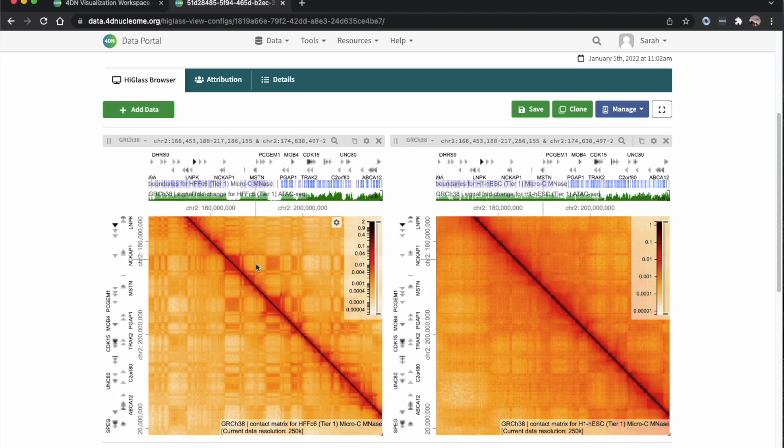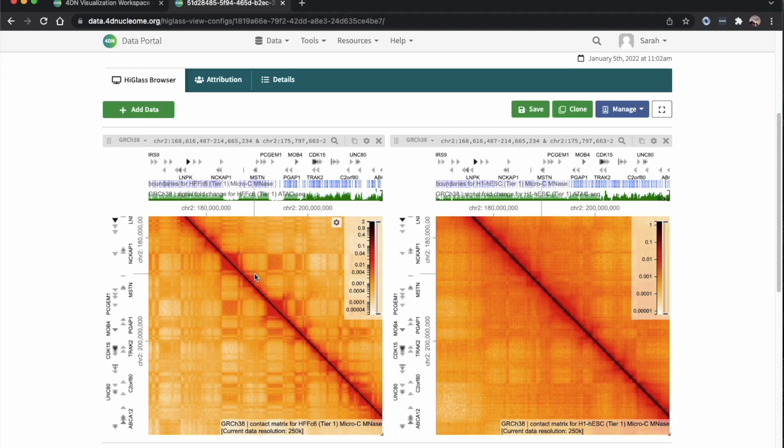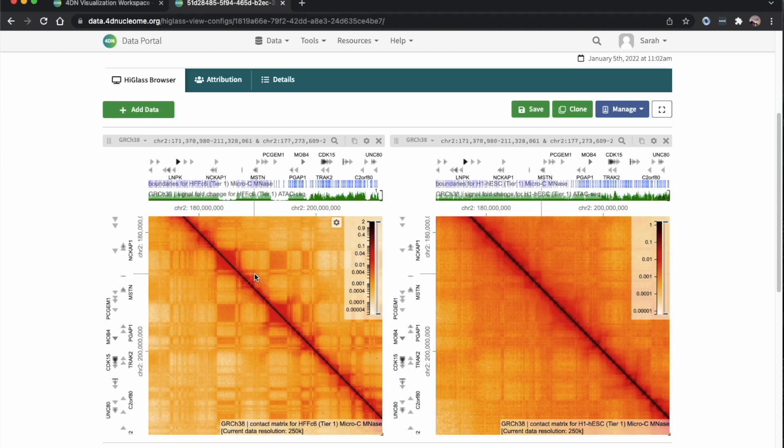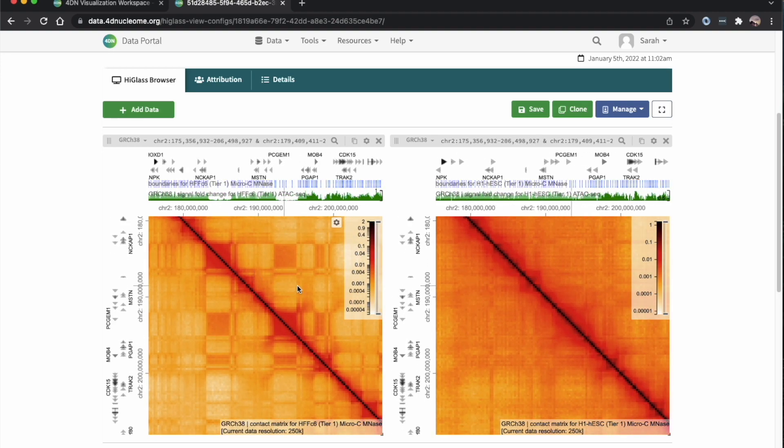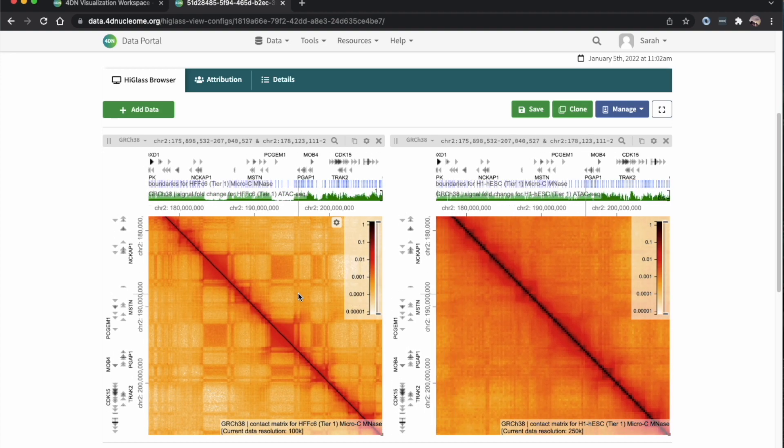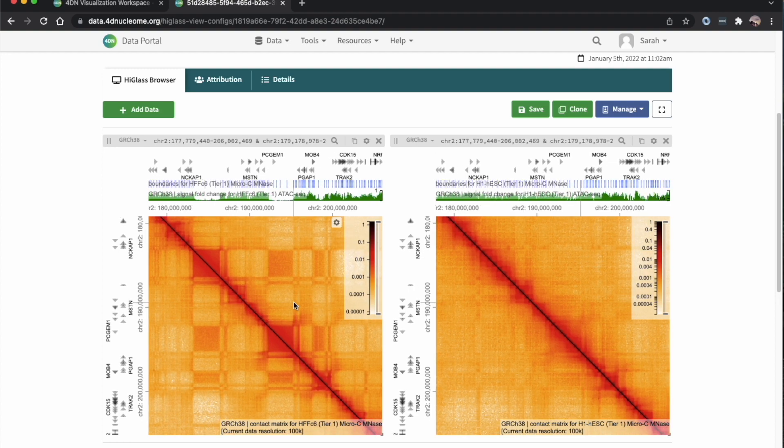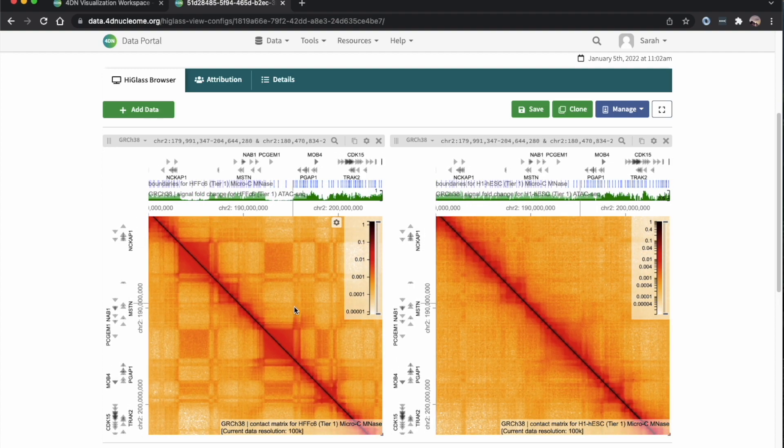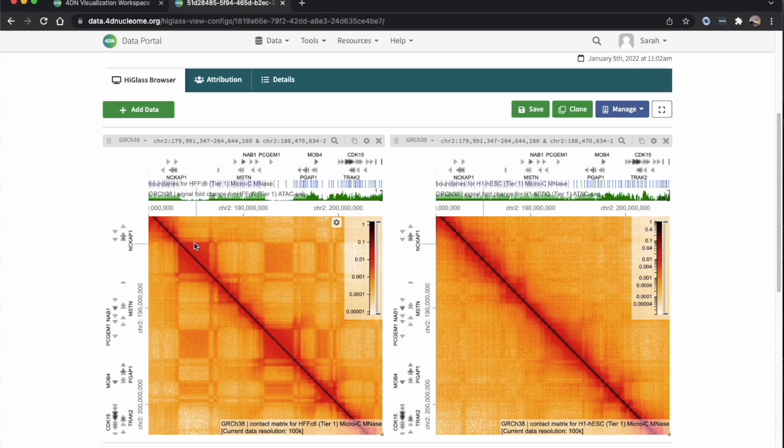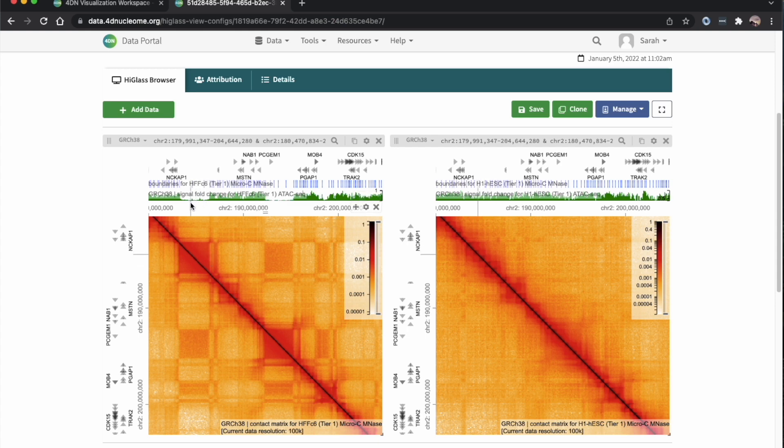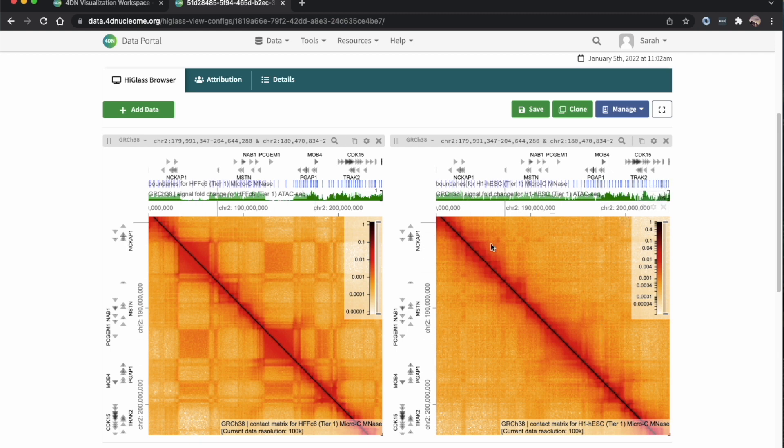So we get this area with some really nice associating domains. We can see that in the HFF, these associating domains correlate with lower chromatin accessibility, whereas in the H1 stem cells, we have a different kind of pattern and don't see that decrease in chromatin accessibility.